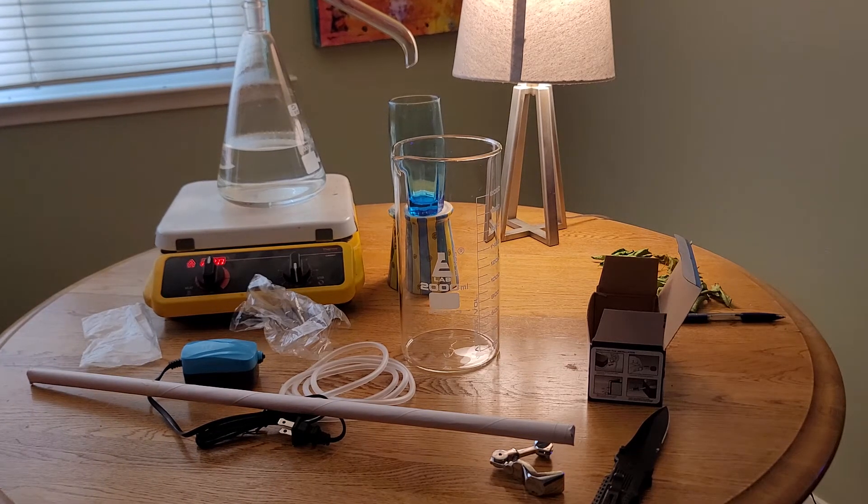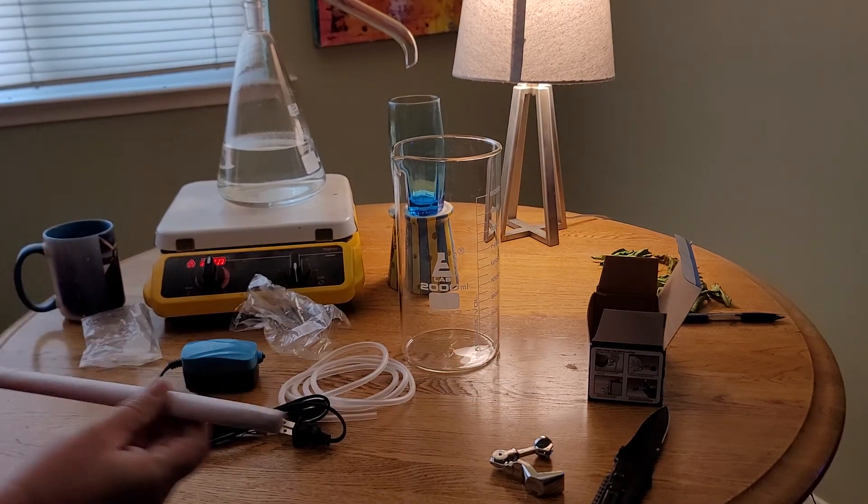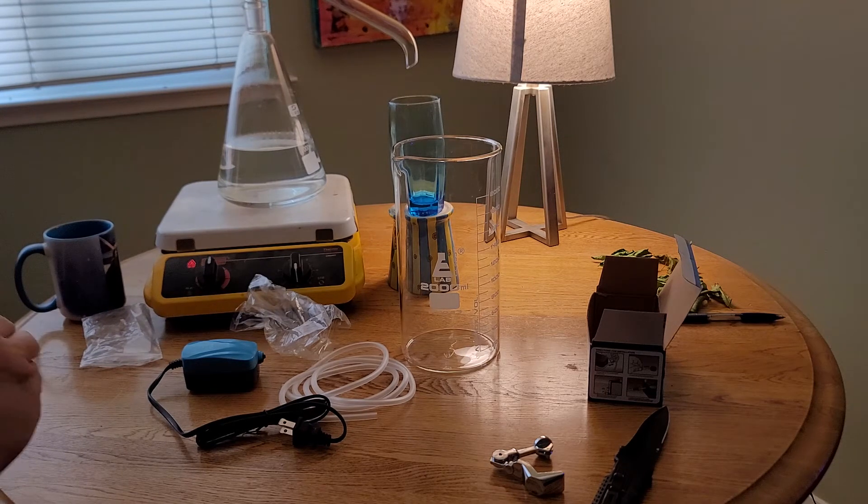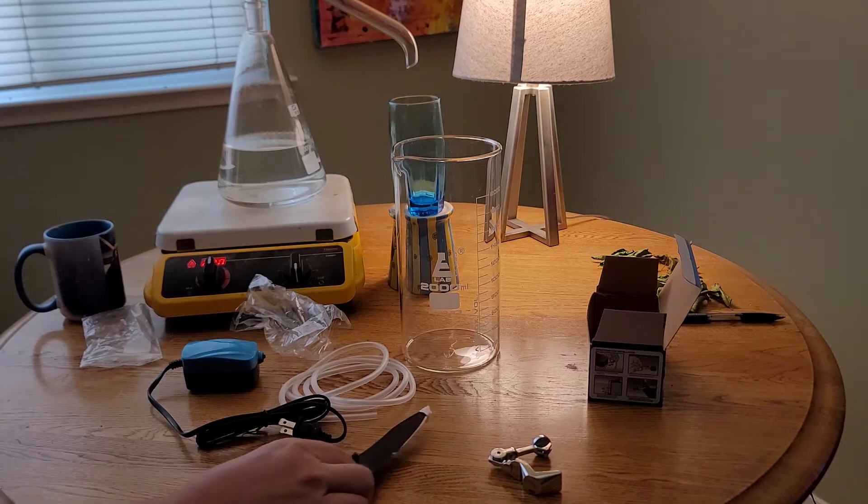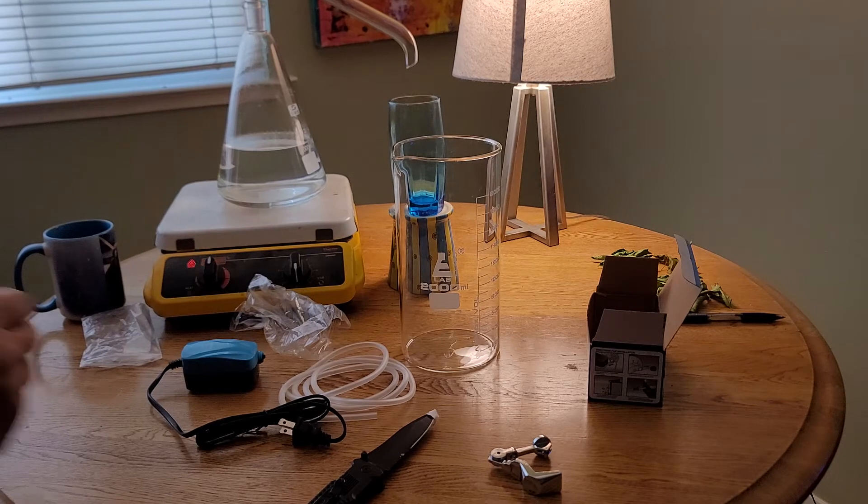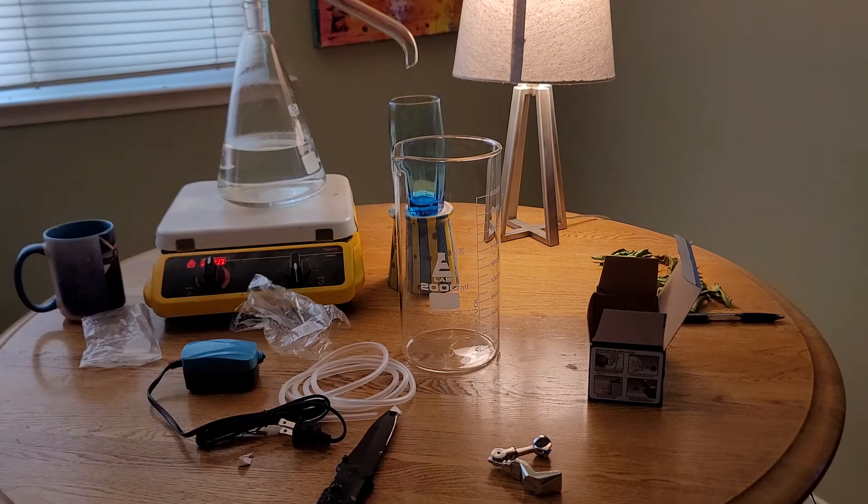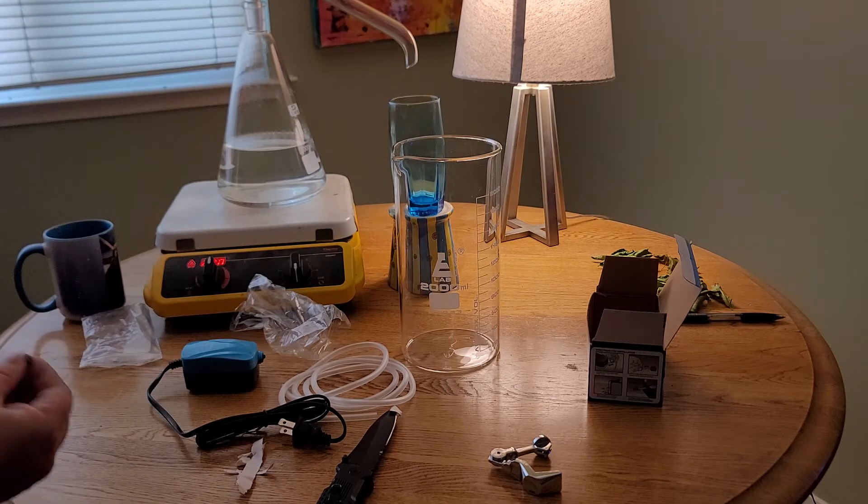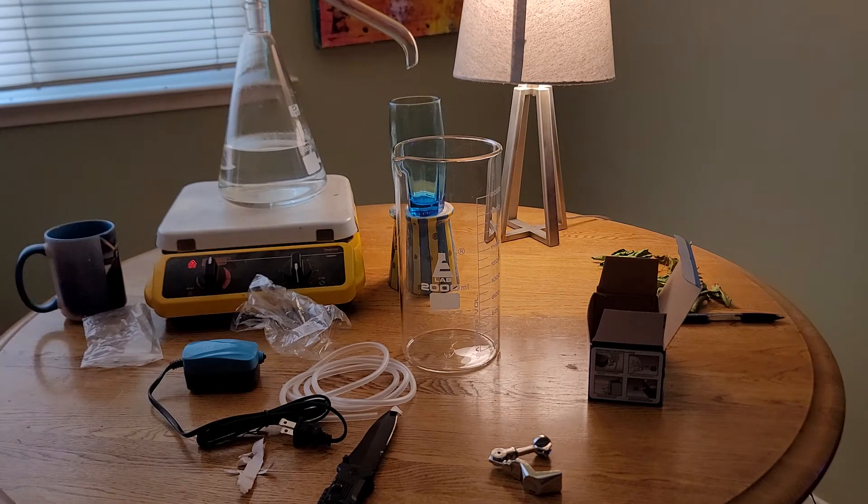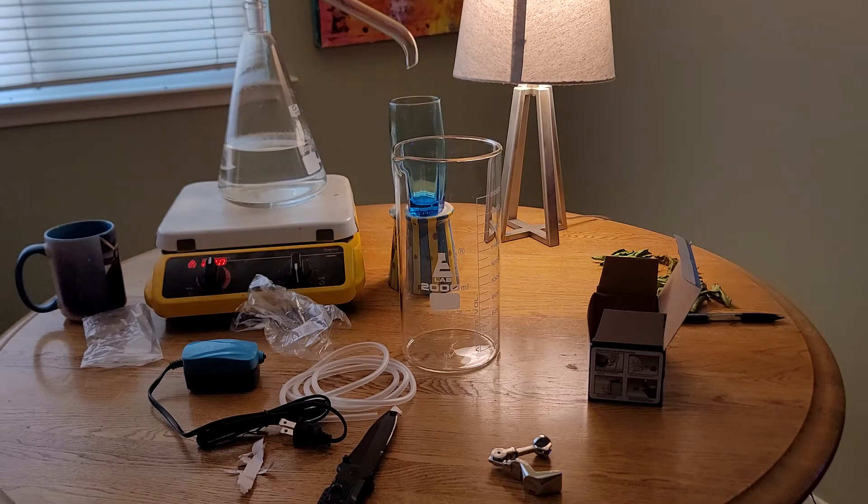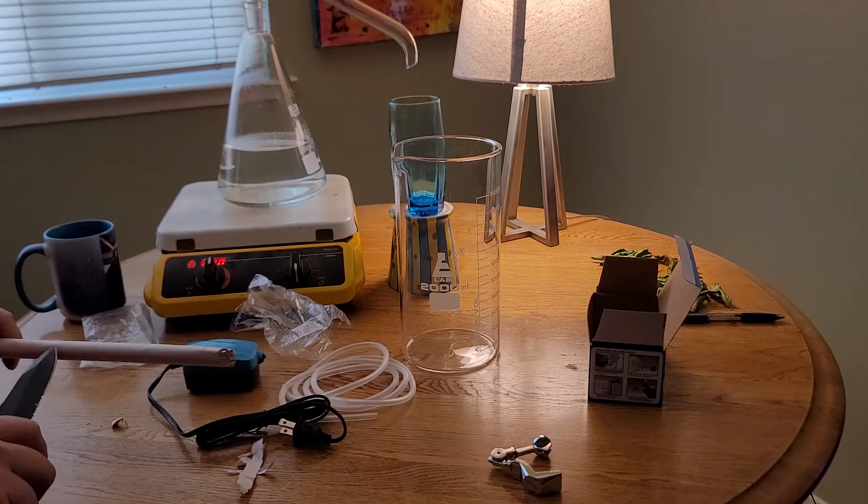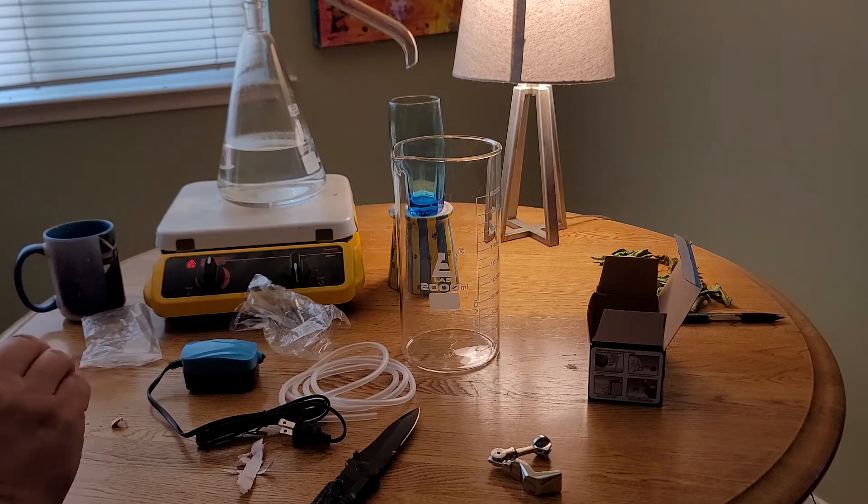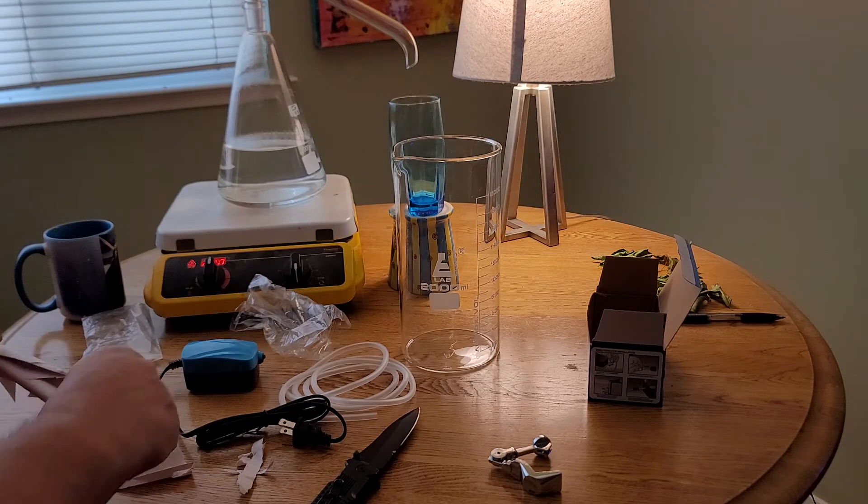I need some coffee. Now this is supposed to be glass tubing, glass tubes in here. I guess the best way to open it is with this knife. Seems to be packaged well. Now these were advertised as 5mm glass tubes. And I researched a little bit about this aerator pump and determined that these tubes should fit the tubing that came with the aerator pump.